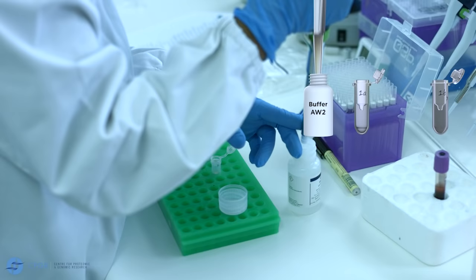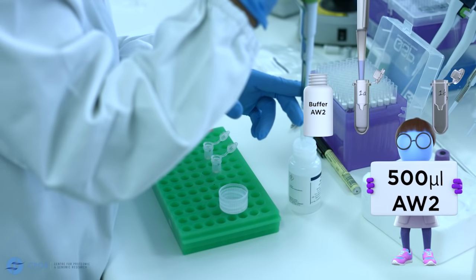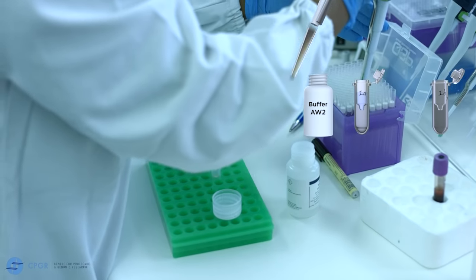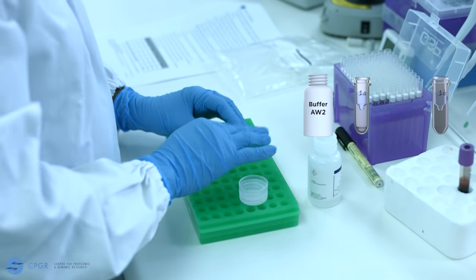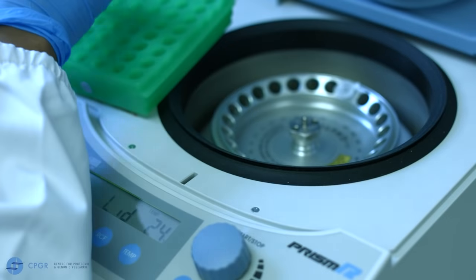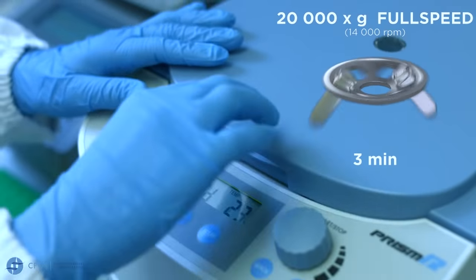Carefully open the lid and add 500 microliters of AW2 without wetting the rim of the spin columns. Close the cap and centrifuge at full speed, that's 20,000 g, around 14,000 rpm, for three minutes.